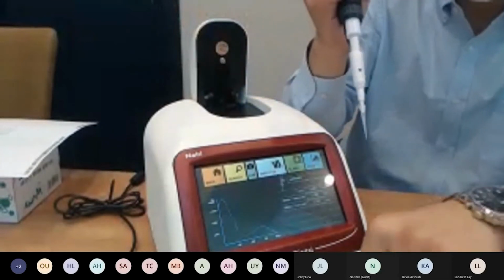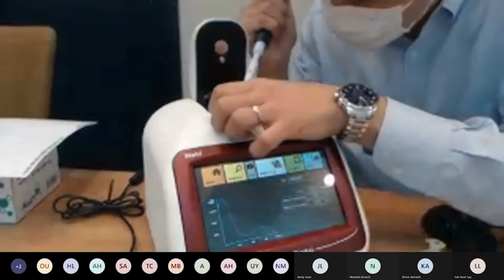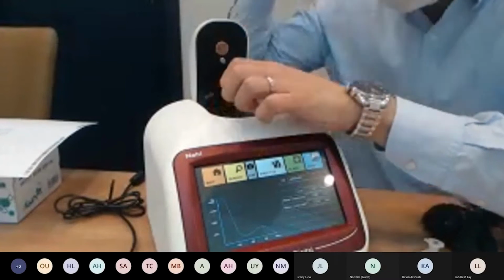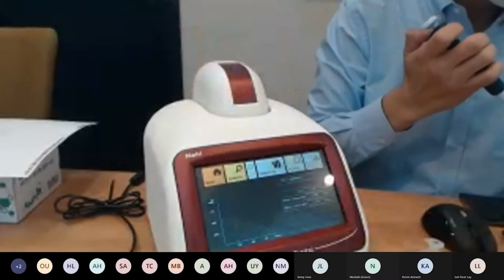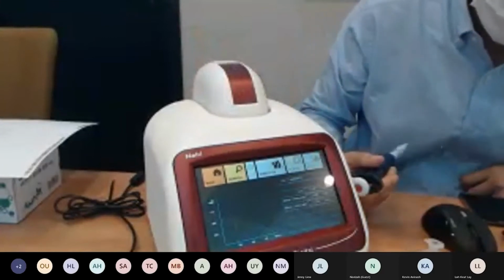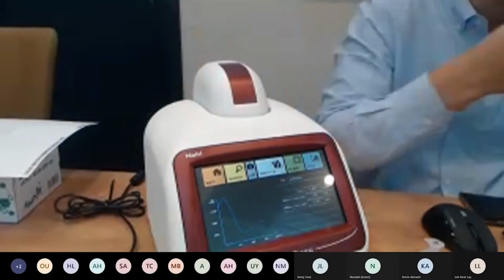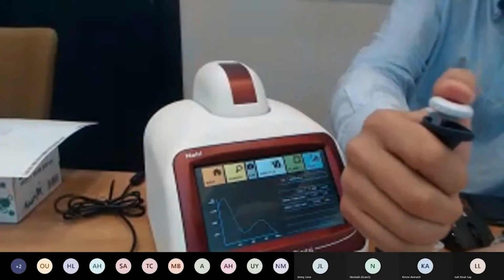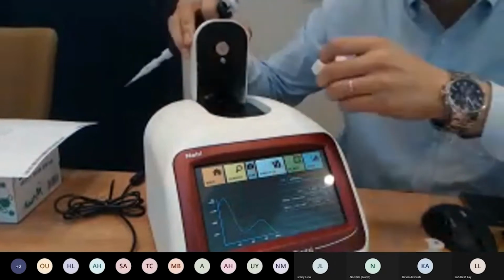And let's try with a higher concentration sample this time. .8, right, which is correct. Next, try again, and as we see, the values might have increased, but the graph shape should be the same.